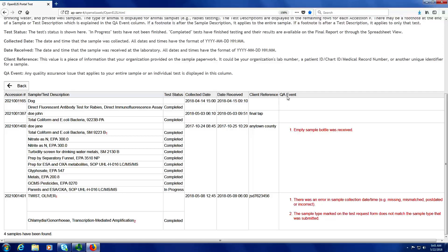The last column will contain any QA events or quality assurance events. These QA events are numbered, and the number goes back to the footnote next to the test or sample information, so that you can see what level this quality assurance event applies to. Since this number one follows the test and method name, I know that this quality assurance event only applies to this specific test and does not apply to the other tests on this sample. In the example for this clinical sample, the first quality assurance event applies to the entire sample since it follows the patient's name. The second QA event applies only to this specific test since it follows the test and method name.